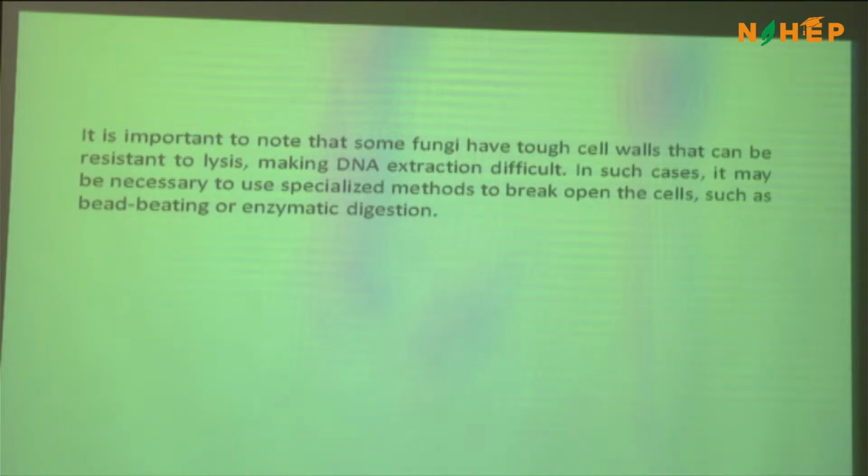What I'm trying to tell here is extraction is the same. You can use different approaches for exploring different microbial domains, right? If you use the V3, V4 marker, you are addressing the bacterial diversity analysis. If you are using ITS, perhaps you are addressing the fungi, right? For oomycetes, for protists, for other microfauna also, you can deploy different kinds of markers to analyze all microbial life which is there in the environmental samples.